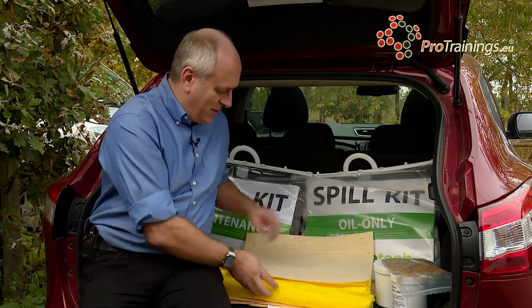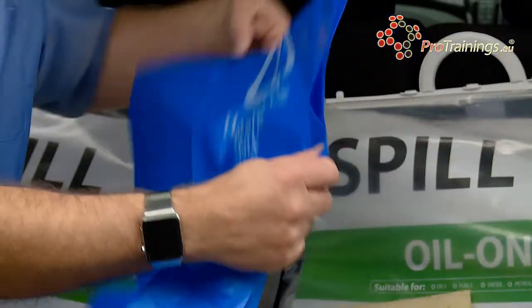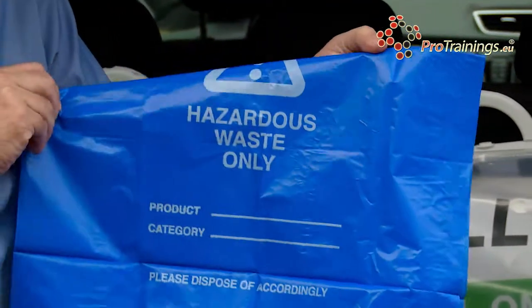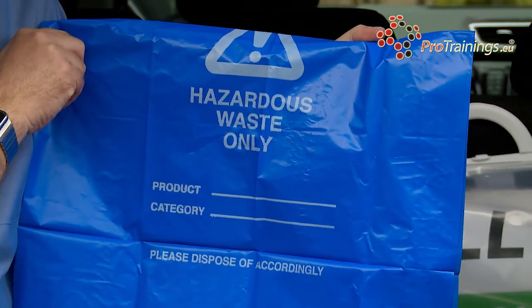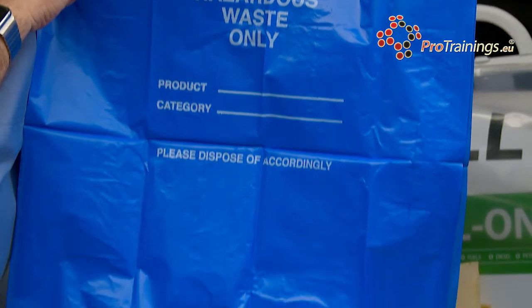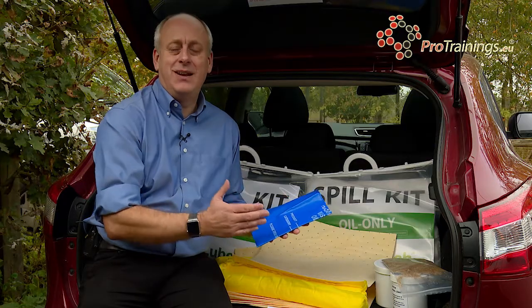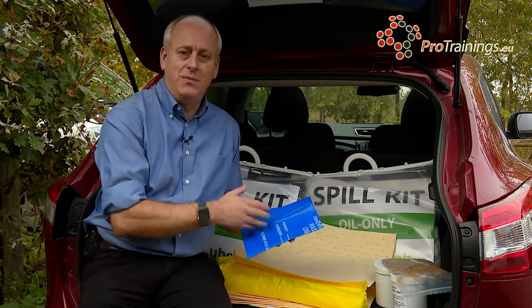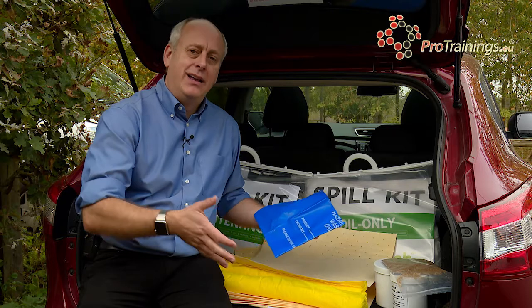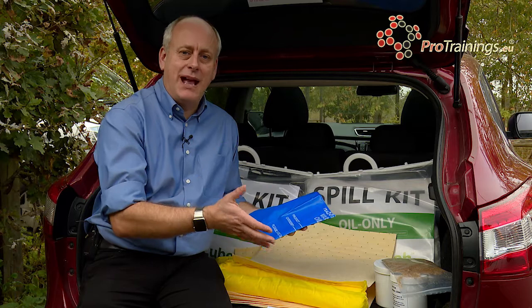Most of these kits will also come with a disposal bag for collecting the waste products. When loading the bag, make sure you get everything in safely. This is not an easy job to do on your own. If you are out on the road transporting and it might just be you, but if someone else can help, then get some help — one person can hold the bag open while the other collects the pads and the sock and gets them into the bag.